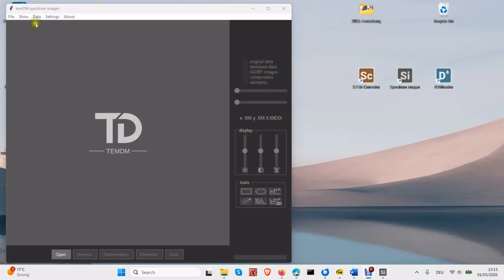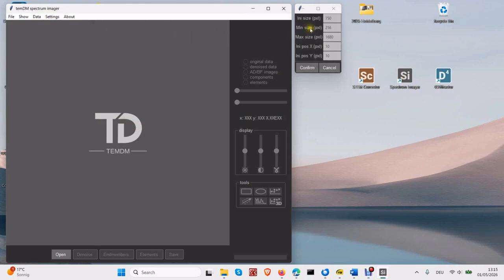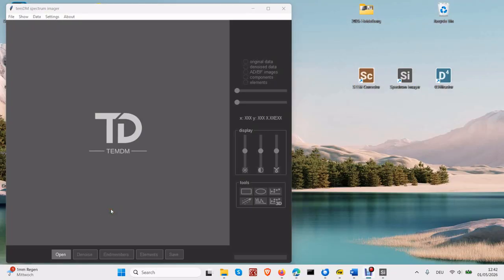There are additional settings related to the frame size, for instance, the initial position, defined by the X and Y coordinates of the top left corner relative to the screen. That is quite straightforward. Besides the main frame, there are many others. Let's open a dataset in the meantime.